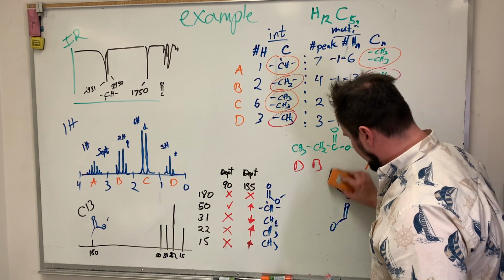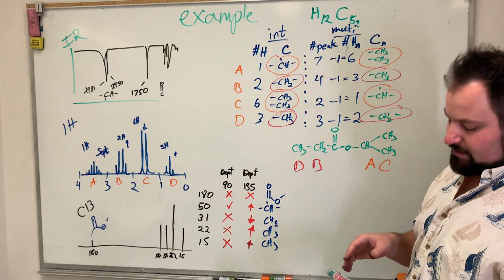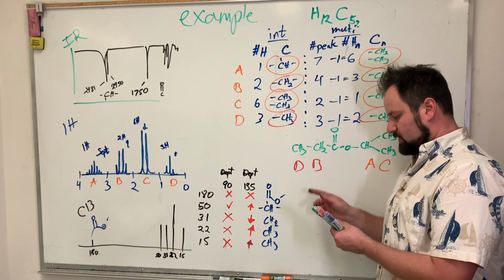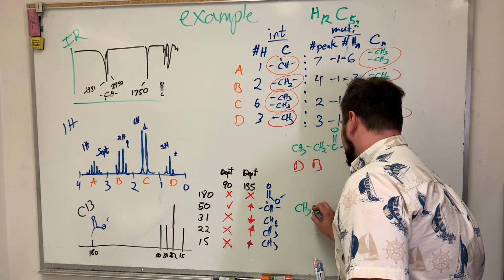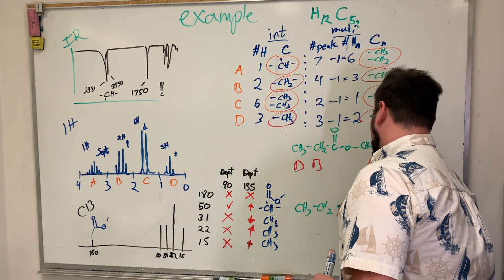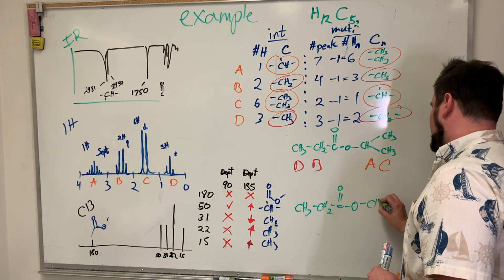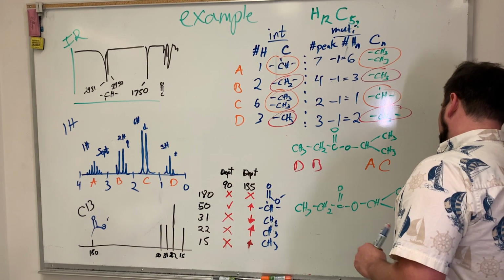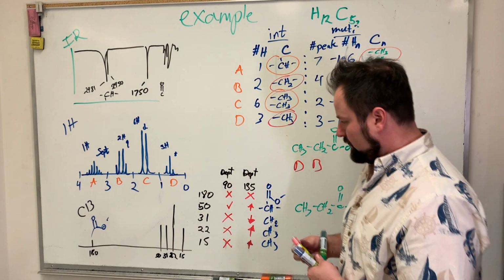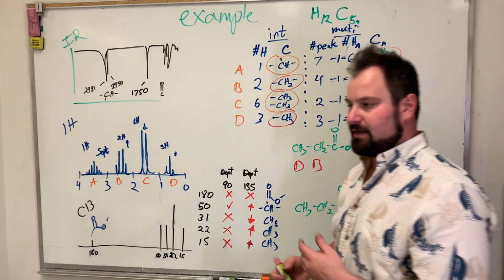And so we can get rid of that. We don't need this anymore. This is our molecule as we anticipated. Our last thing we have to do is redraw this molecule one more time. CH3, CH2, C double bond O, CO, CH, and then CH3. And then we want to label these with some kind of labeling scheme.